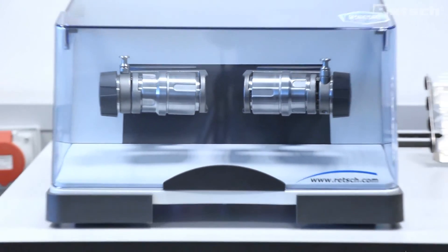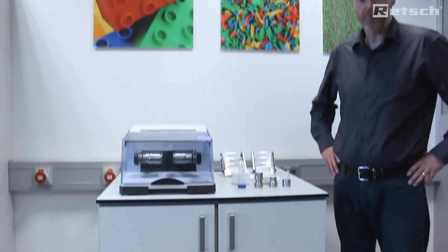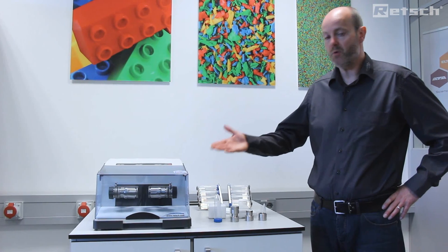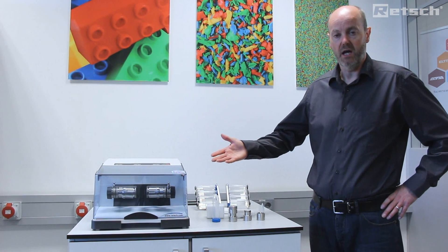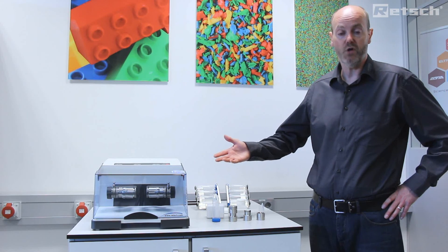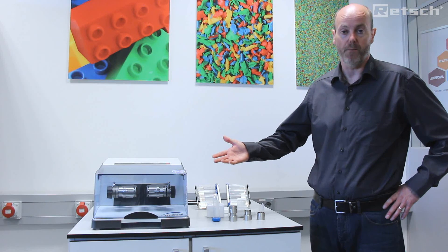The MM400 is an extremely powerful instrument which leads to rapid particle size reduction. After a short space of time, the samples are ready to be recovered. I trust that you've found this introduction to this instrument of interest. For further information, please visit www.retsch.com for more detail.